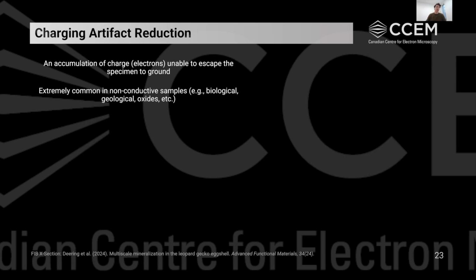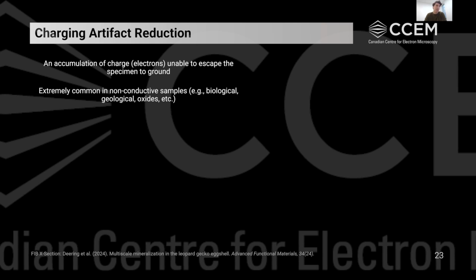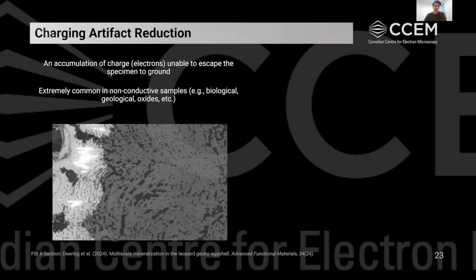The second artifact I want to talk about is charging. Whether you're using a biological or geological sample, maybe something based on oxides, it's non-conductive specimens where we start to see this the most, where we have an accumulation of charge, electrons that we're putting in that are unable to escape the specimen. And the resulting image can look a little bit like this.